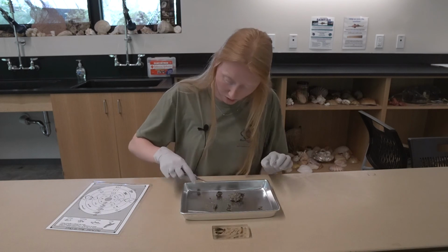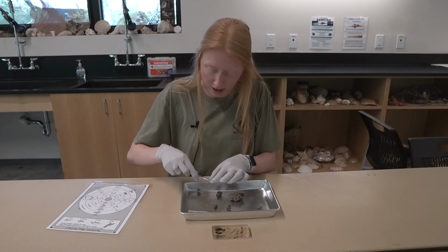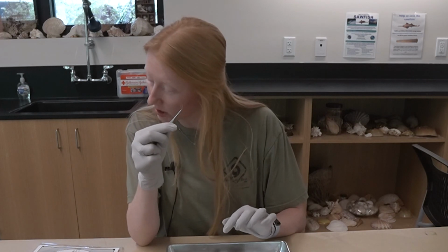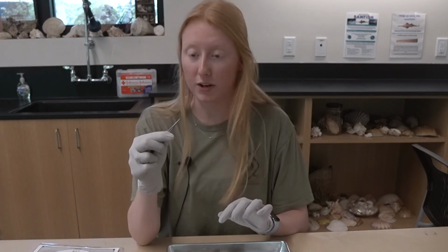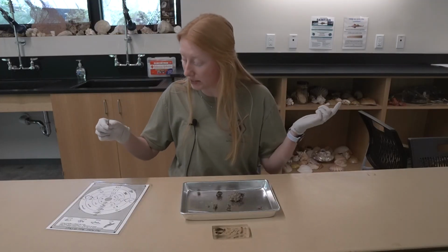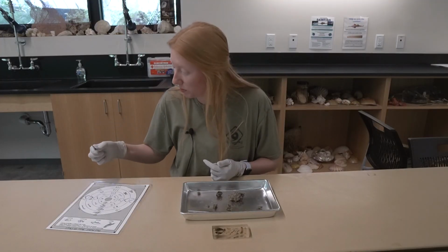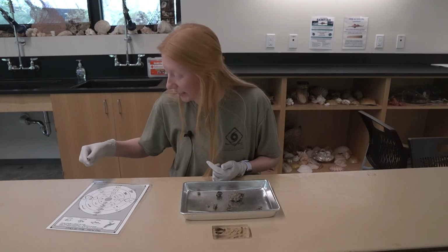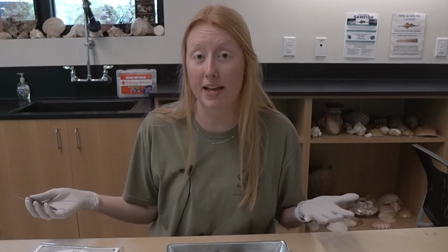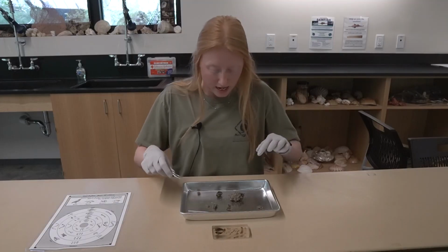So right here, I would imagine that these are two very small, looks kind of like ribs or very, very small leg bones. So we can probably try and place them. So this would, I would assume, be a front leg of some very small rodent because it kind of matches the picture. Let's see.